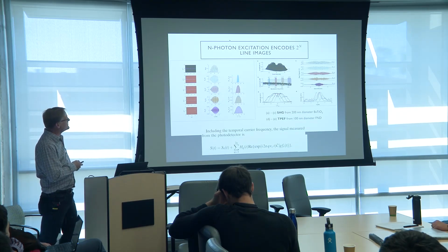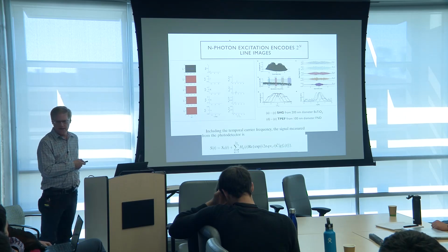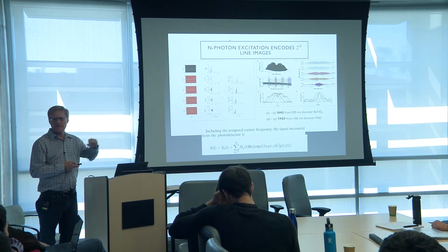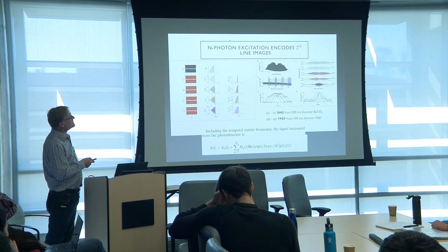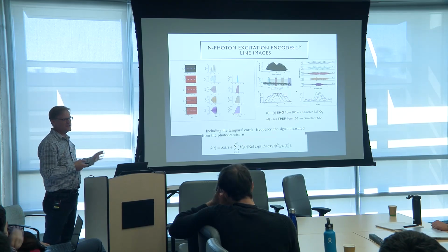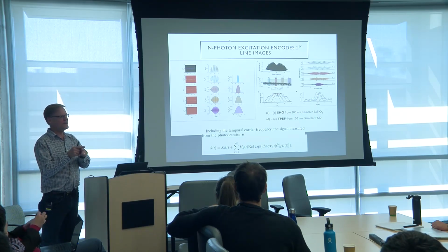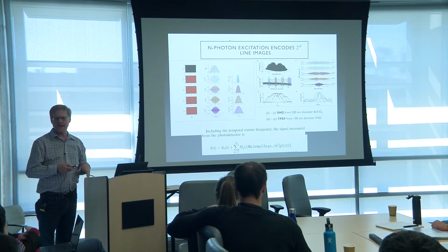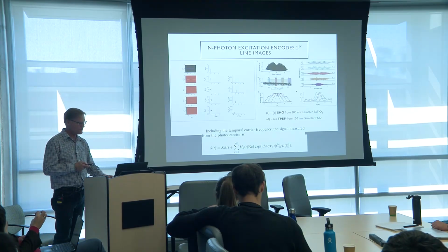So you can see the individual terms and how it builds up, and each term leads you to a little bit of an ability to push that cutoff frequency further and further out. It turns out here there's a lot of noise initially because in our first mask, we have a lot of interference from other orders and stuff that are adding structure. So it's not as clear in these first initial images, and that's where we put a lot of work into it.